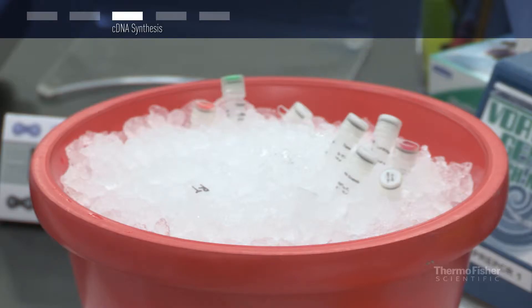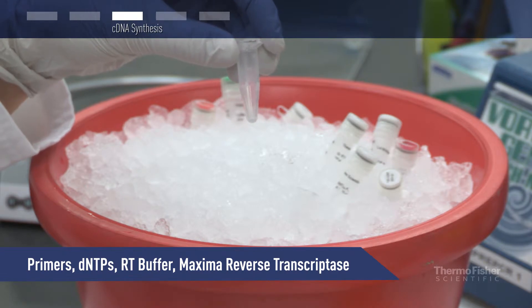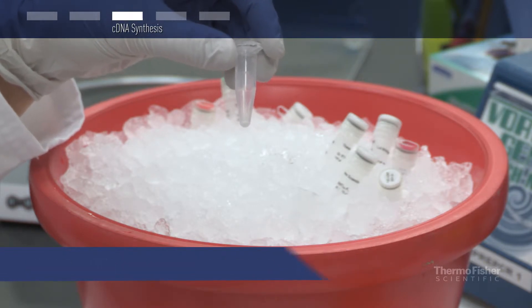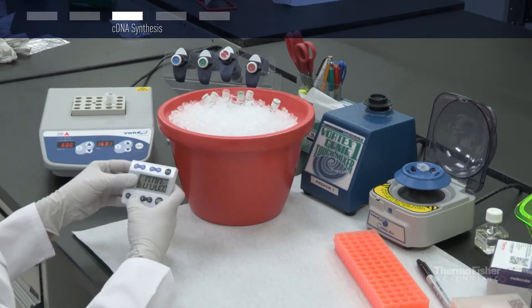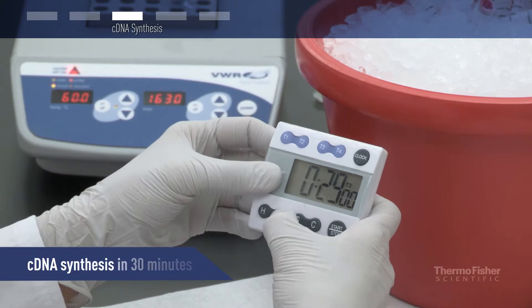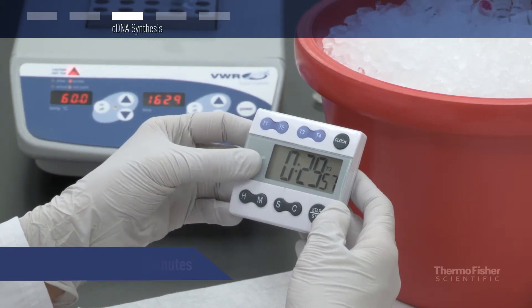Now proceed with the cDNA synthesis step. To the same reaction tube, add primers, dNTPs, RT buffer, and the Thermo Scientific Maxima reverse transcriptase. Maxima reverse transcriptase enzymes are exceptionally thermostable and allow cDNA synthesis at temperatures from 42 to 60 degrees Celsius.